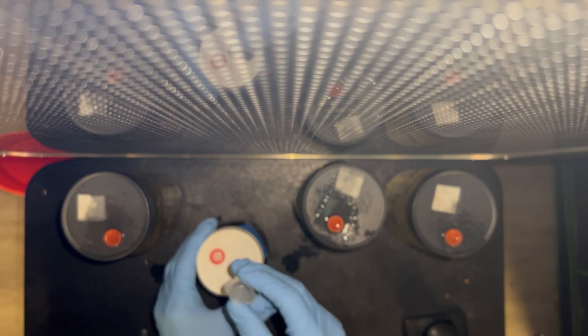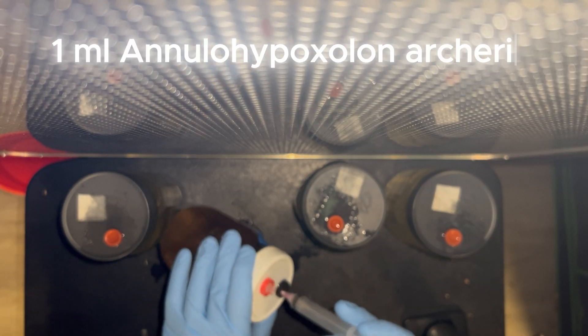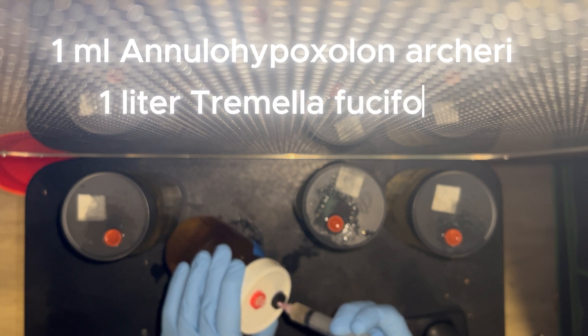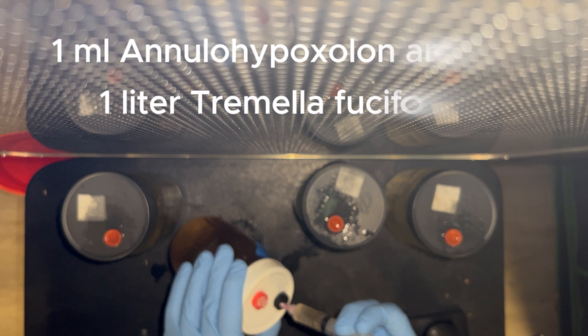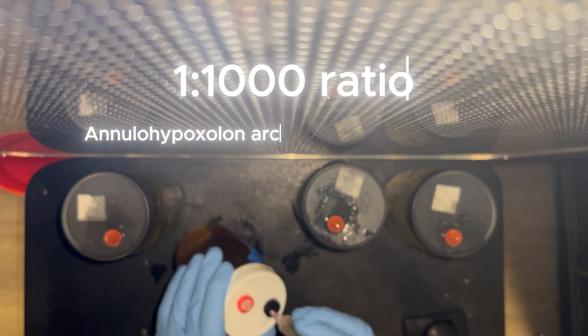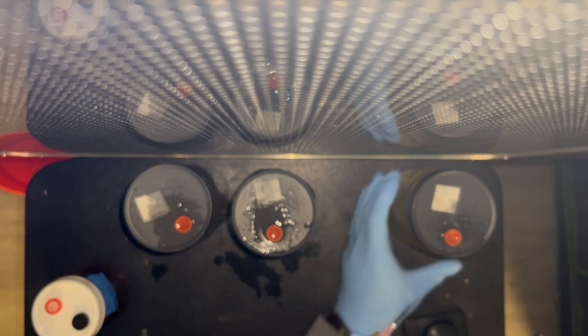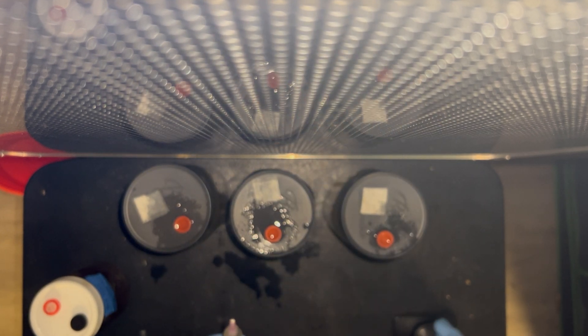Once you inoculate the liquid culture, within about four to five days you're going to take one milliliter of the Annulohypoxylon or cherry and inoculate it into a liter of Tremella fusiformis. That's a one-to-one-thousand ratio of host species to snow fungus, because the host species is actually far more aggressive than the tremella and will out-compete it. So you need to use only one milliliter of the host species per one thousand milliliters of Tremella fusiformis.